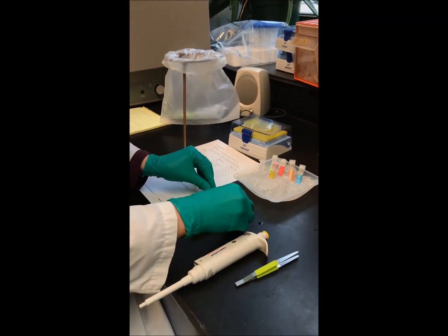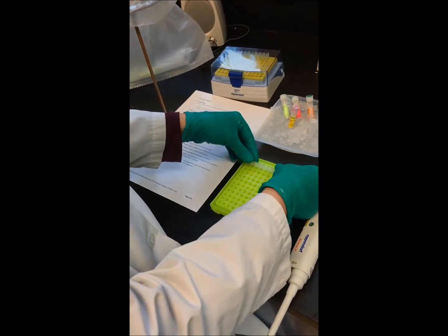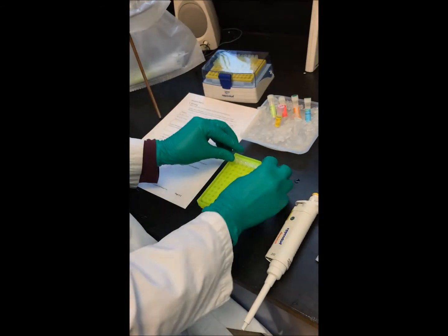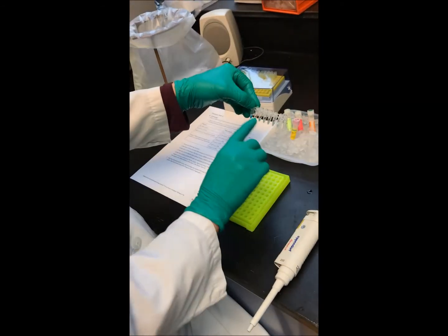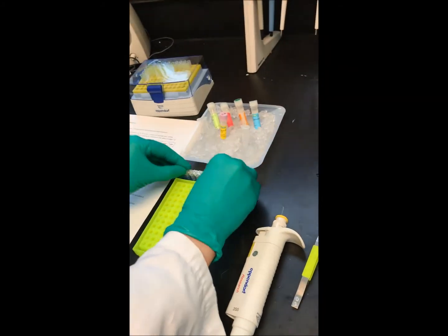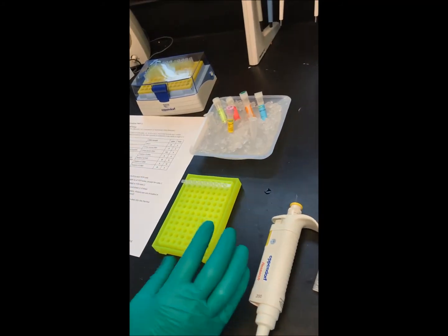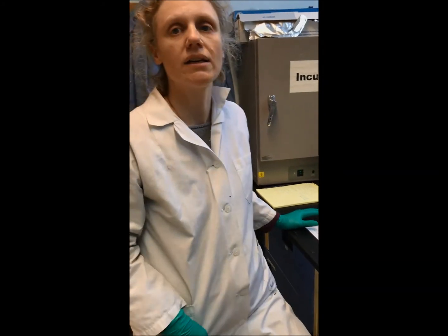What I need to do now is I have to close the tube caps, press down, and I'm ready to put them in the PCR machine. And the PCR machine, if you remember, is a thermocycler. See, all my tubes are ready. They all contain the mix. If you remember the PCR machine, it's a thermocycler. It increases and decreases the temperature automatically.